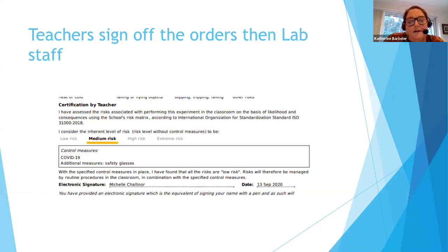So in a way, risks in schools rely a lot on the qualification of the teacher, and also the work of the lab assistant. That's probably one of the biggest difficulties in schools, because our lab assistants, who are integral to the science faculty, may not have formal training in science. Many, and I must stress I'm only speaking on behalf of public schools, are what we call SAS staff, school administration support staff. They're recruited at the same level as somebody working in the office.